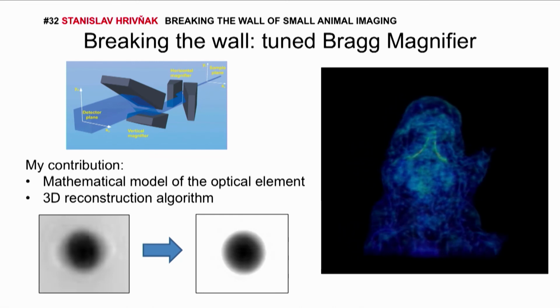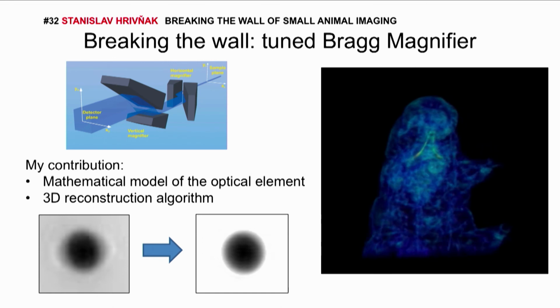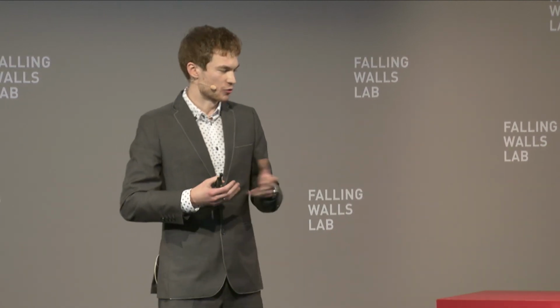So for example, here you can see it. The size of it is approximately 100 micrometers, and we performed this in a resolution of around 300 nanometers. So this was all done by this tuned Bragg magnifier with our new algorithms. So thank you very much.